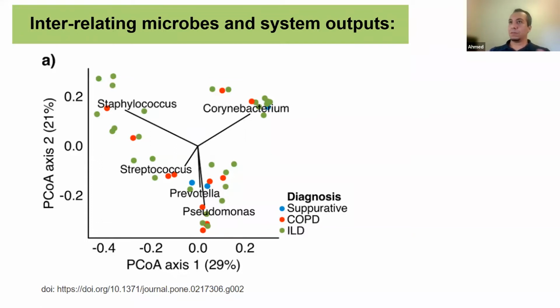The basic principle behind this is that we have this multi-dimensional data. Each dimension is basically the set of abundances that we have for each taxon. And you are reducing this dimensionality into only 2 dimensions. This is the first axis here, and this is the second dimension, okay? And that is capturing around 50% of the variation in your data.